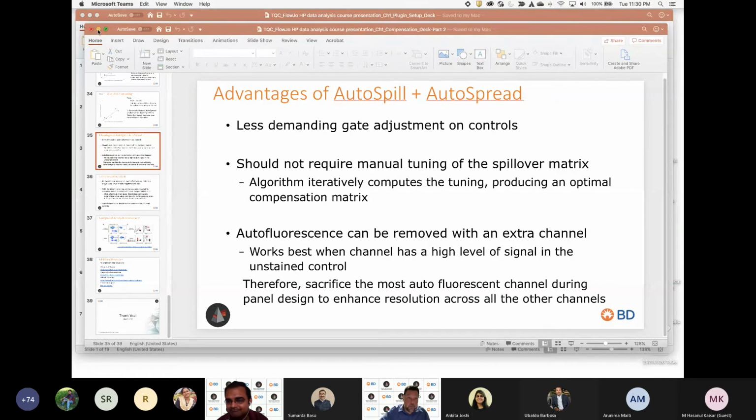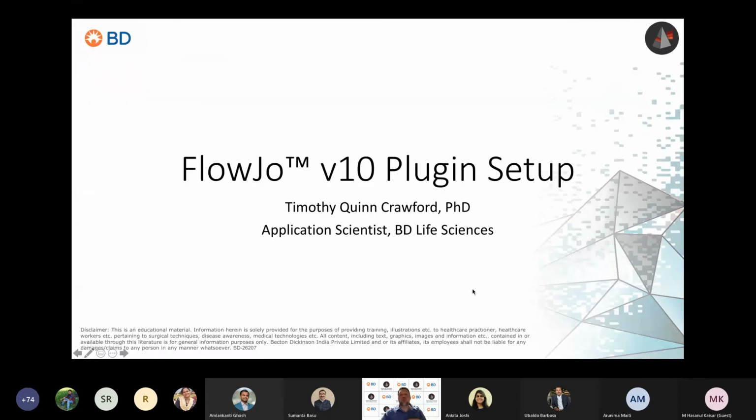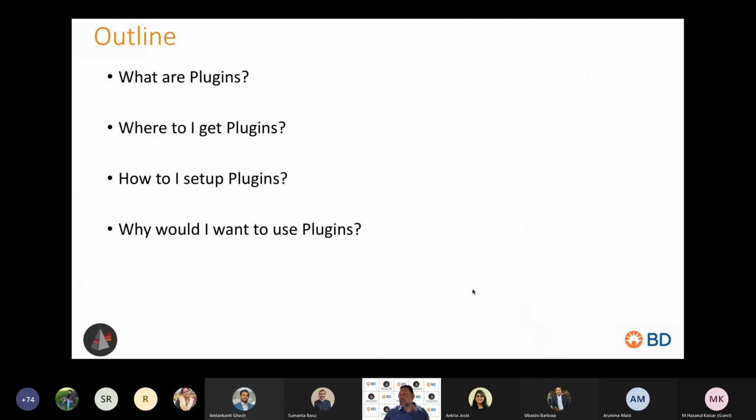Great, thank you guys so much. I know I've gone a little slow here. It's a lot of content to cover, and we've taken our little breaks and asked some questions. So this last section is all about setting you up for next week and the week after, to give you an idea of how to set up your tools for some additional functionality within FlowJo. These tools, we generally call plugins, because they are external little files that you can add to your FlowJo setup to run an algorithm or a process that isn't within the base package of FlowJo.